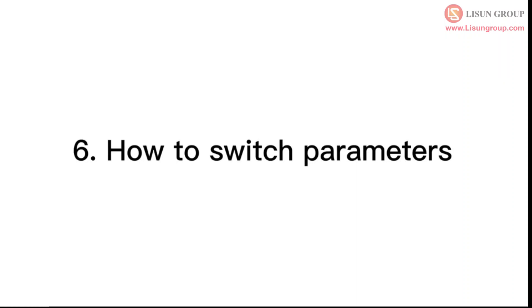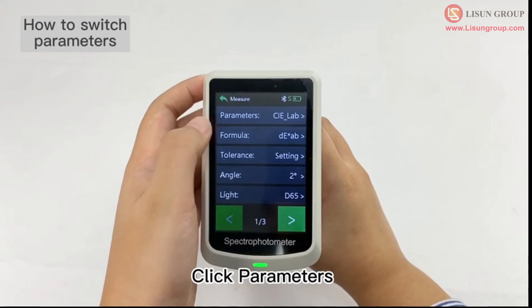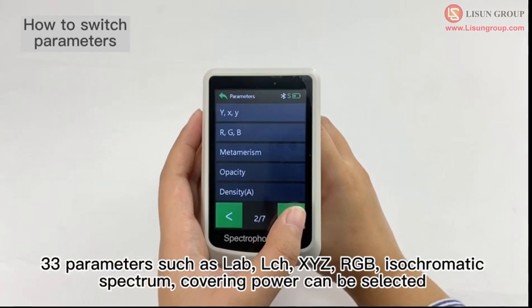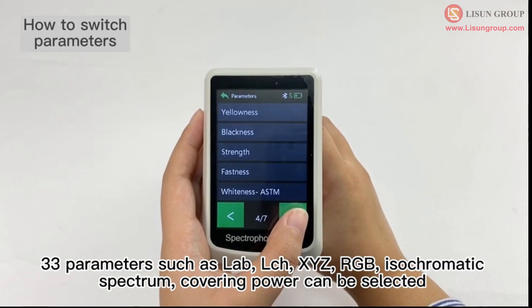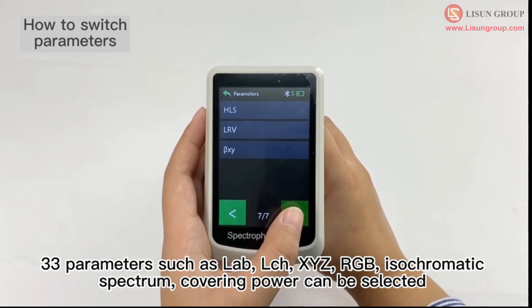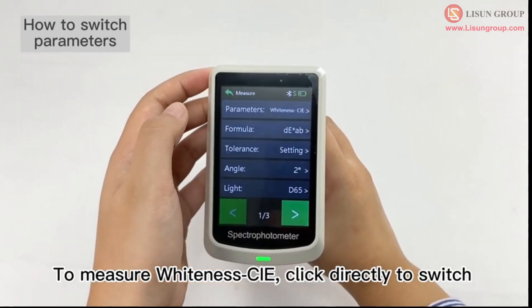How to switch parameters. From the home interface, click setting, then click measure, then click parameters. There are 33 parameters to choose from, such as LAB, LCH, XYZ, RGB, isochromatic spectrum, and covering power. To measure whiteness CIE, click directly to switch.